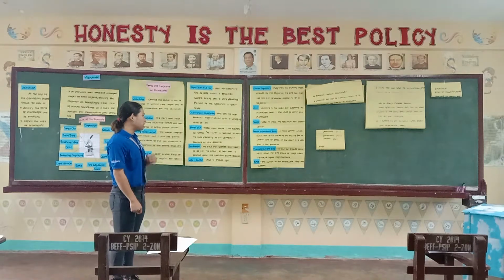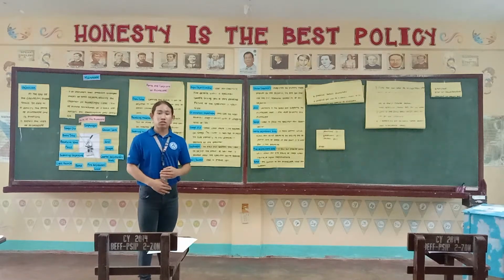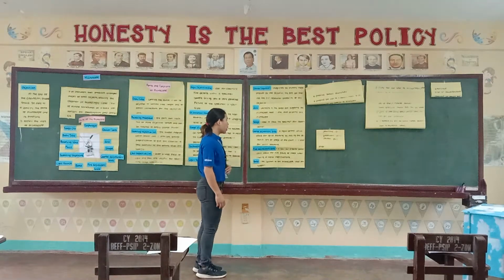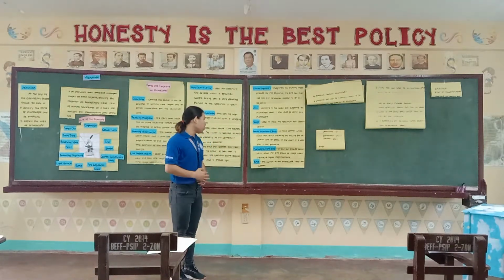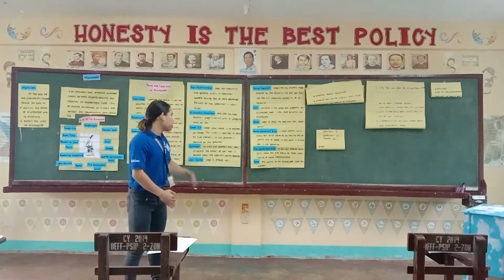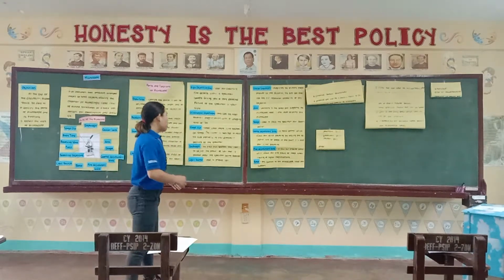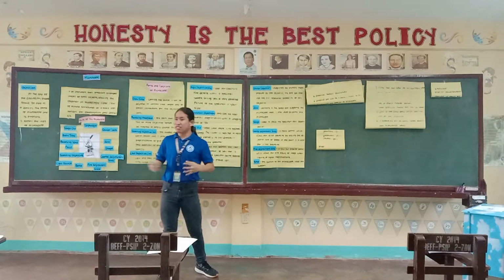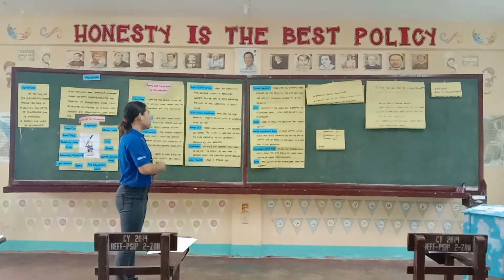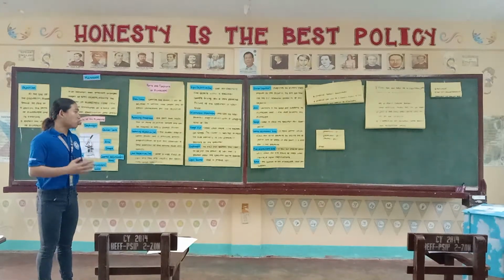So the fine adjustment knob is used for a precise control for a fine focus of an image. So a coarse adjustment is used for moving the lenses up and down. Ang kaning fine adjustment knob po is to precisely focus the specimen or the image you are viewing. So para precisely makita nimo ang entire structure dun sa isa ka specimen or image, you have to use the fine adjustment knob para maimo siyang ma-adjustan to clearly understand or focus the entire viewing.